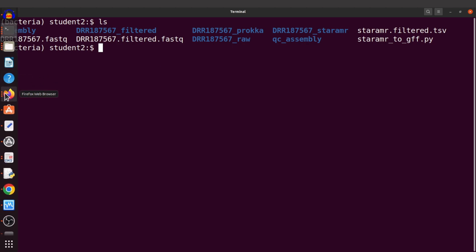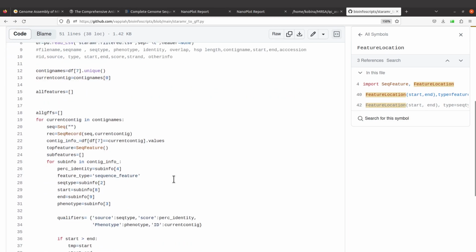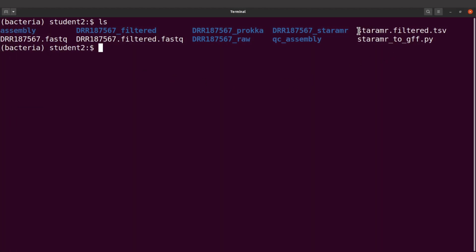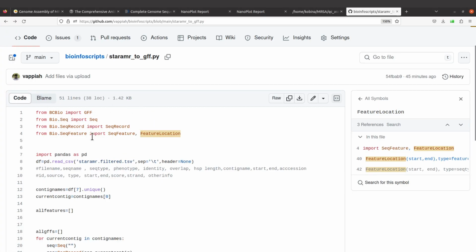So I've already entered all the necessary information in there, and so all that I have to do is to execute it. You need to also make sure that this file here, we have generated it, but make sure it's in your current working directory and it has the same name. If you're using a different file, then you have to change it in the script. So that one, it's up to you, but for now, just make sure that all the information that has been specified in this script here, you have them. That's all that you need.